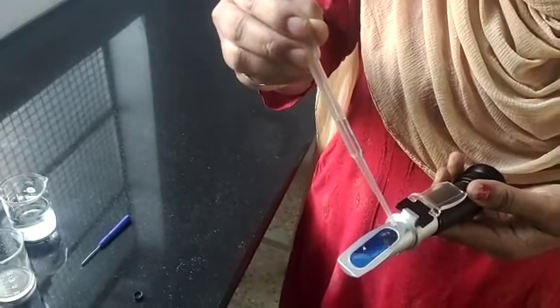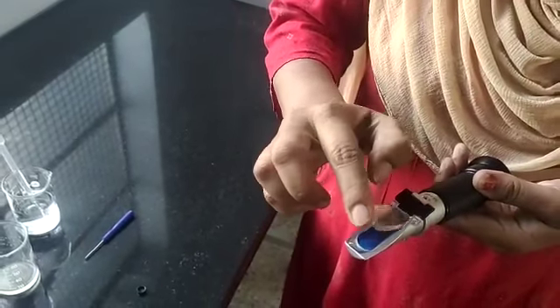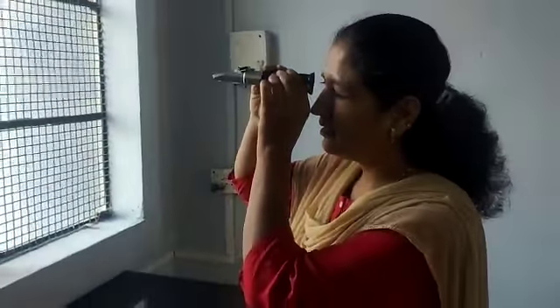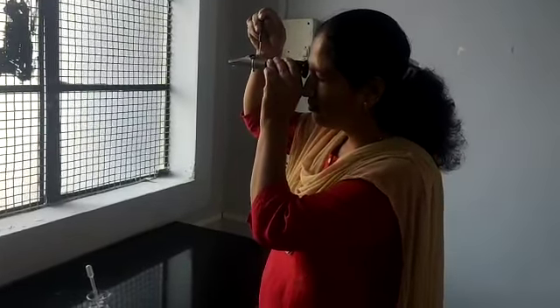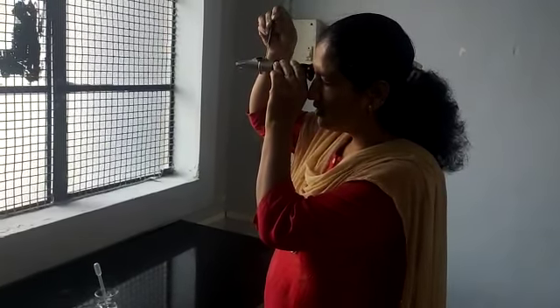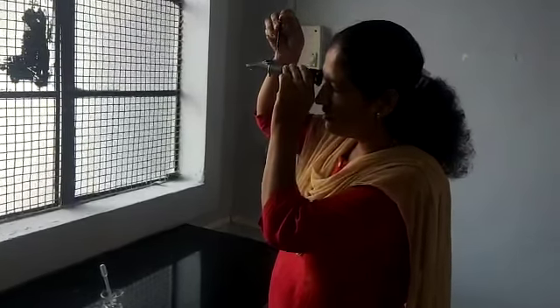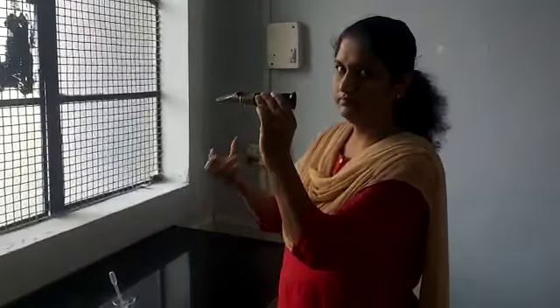Put a few drops on the daylight plate and cover it with the cover plate. Take care that there are no air bubbles, and check the scale reading. Adjust the screw knob — rotate this screw up to zero level. This zero point is indicated by a white line. This white line confirms the hand refractometer is calibrated.